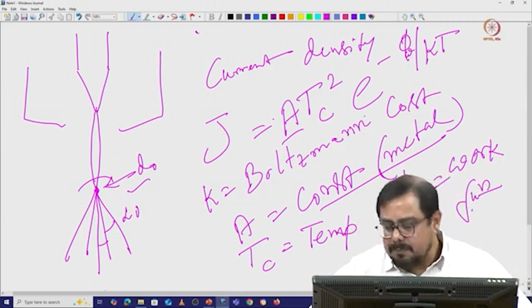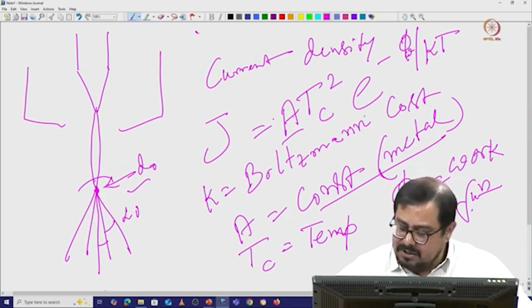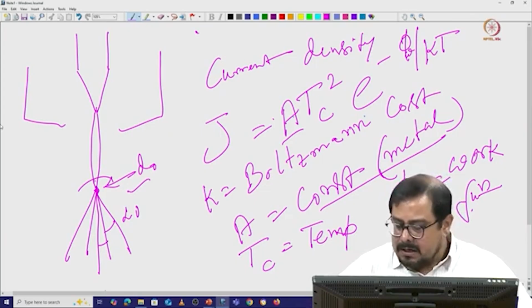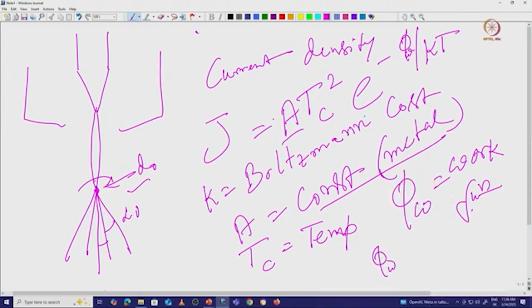That is the reason that, if you look at the work function for the field emission gun in the table I was discussing at the beginning, it is written 4.5, which is almost equivalent to our tungsten filament. Then how is the field emission gun helping us? It is because of these two anodes, which help us pull out the electron properly.